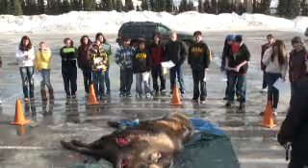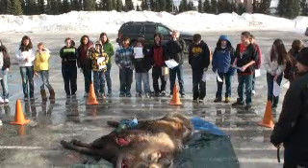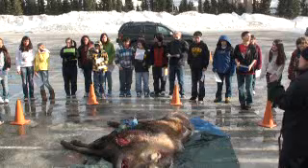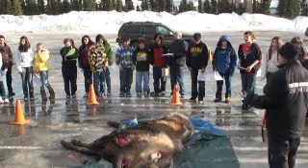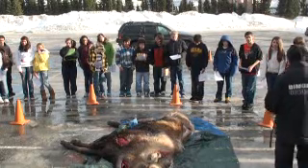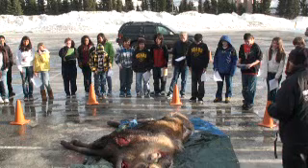Alright, so welcome to the Big Wild Dissection, taken from Anchorage's motto of living in the big wild life. We have packets for you to fill out to make observations and notes on as I go through and talk a little bit about moose and the anatomy of moose. So please feel free to write down while I'm talking.